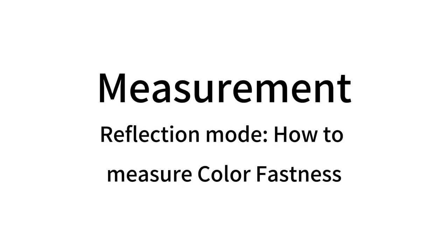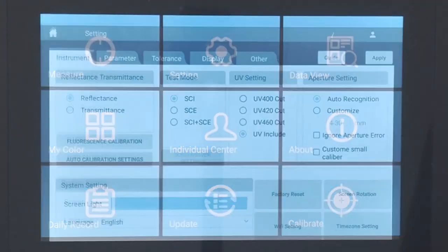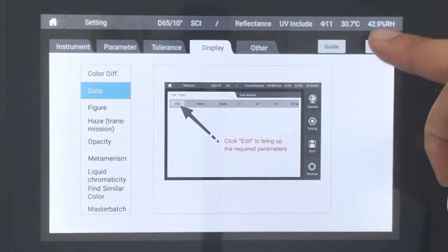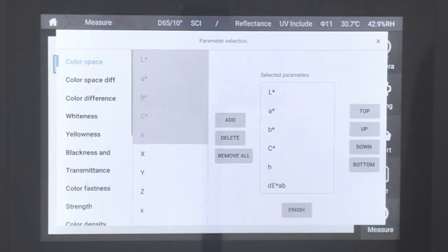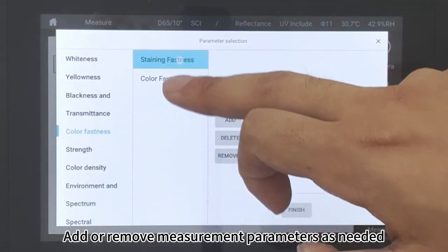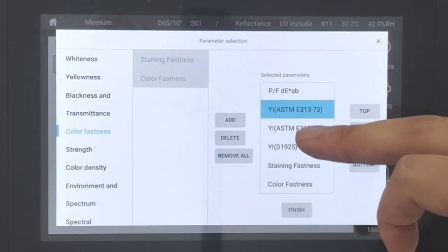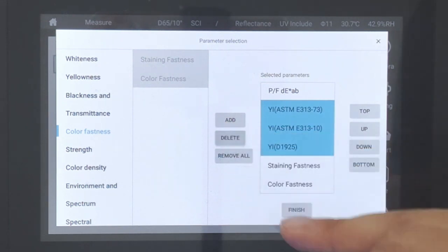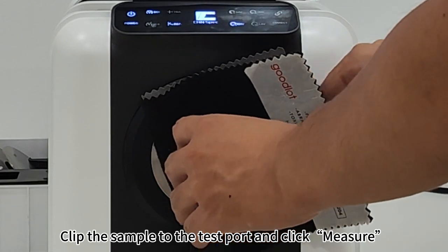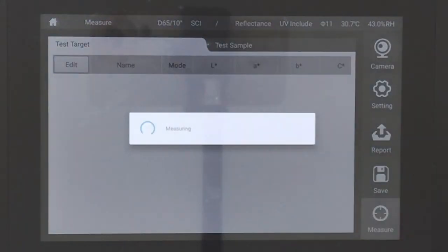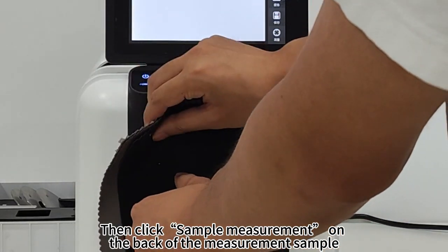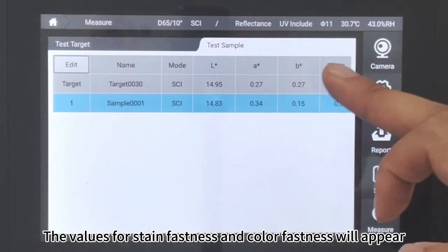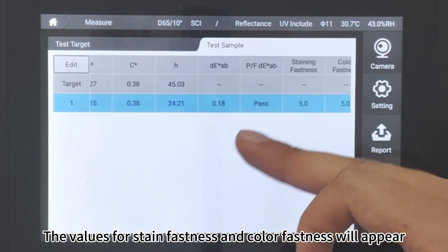How to measure color fastness: Click Setting, then click Display. Select Data and click Apply. Click Edit, then click on Color Fastness. Add or remove measurement parameters as needed. Click Finish. Clip the sample to the test port and click Measure. Then click Sample Measurement on the back of the measurement sample and click Measure. The values for stain fastness and color fastness will appear.